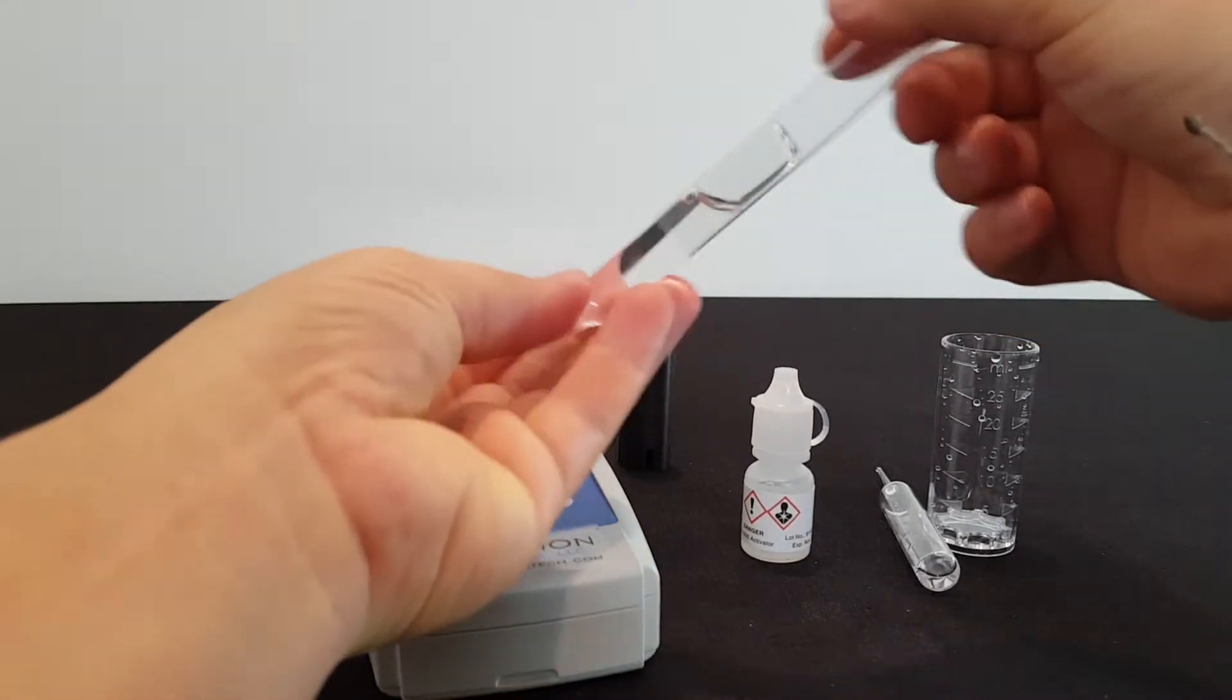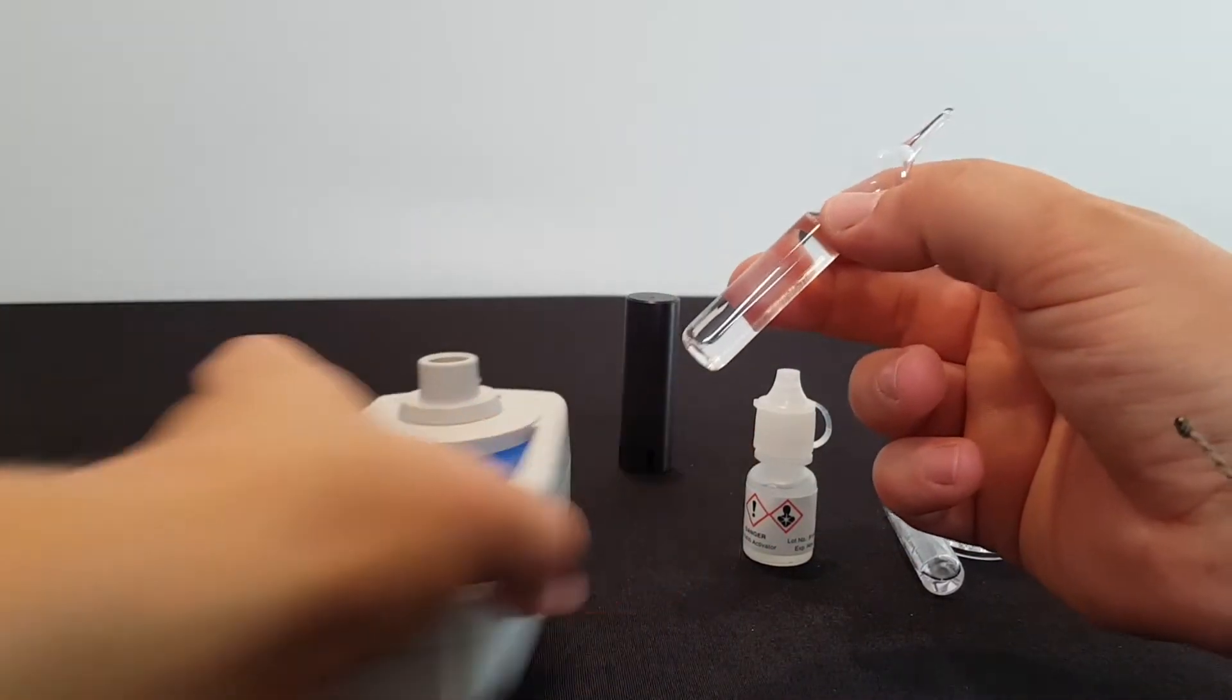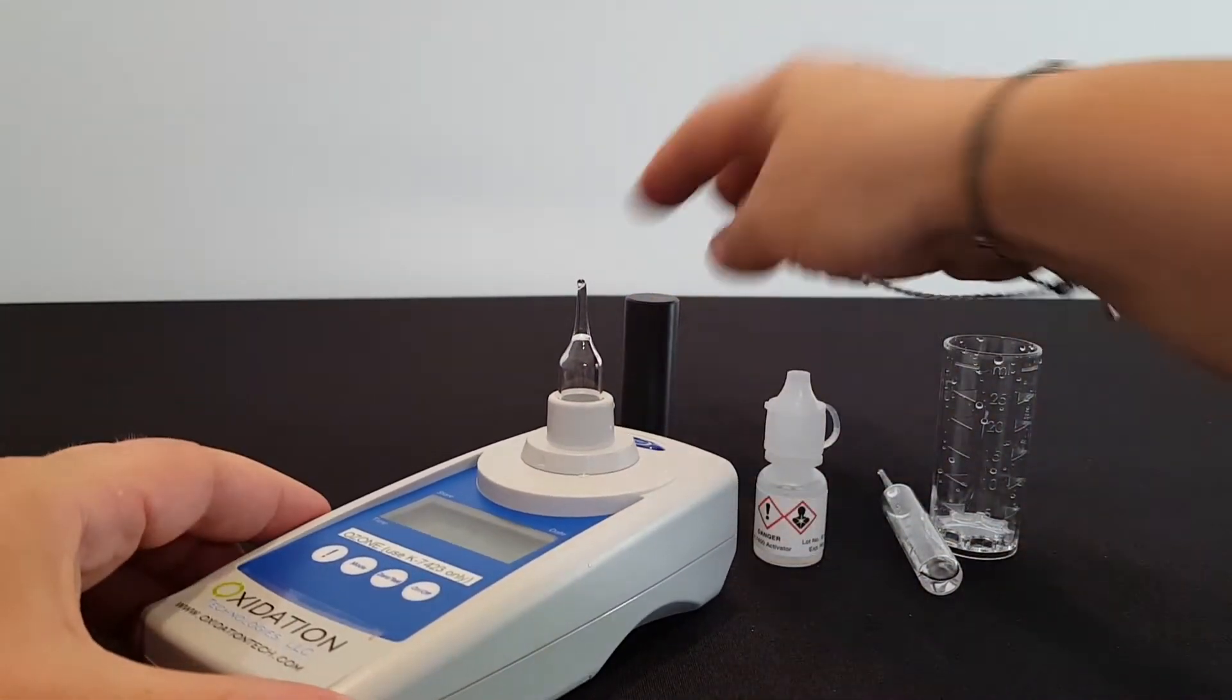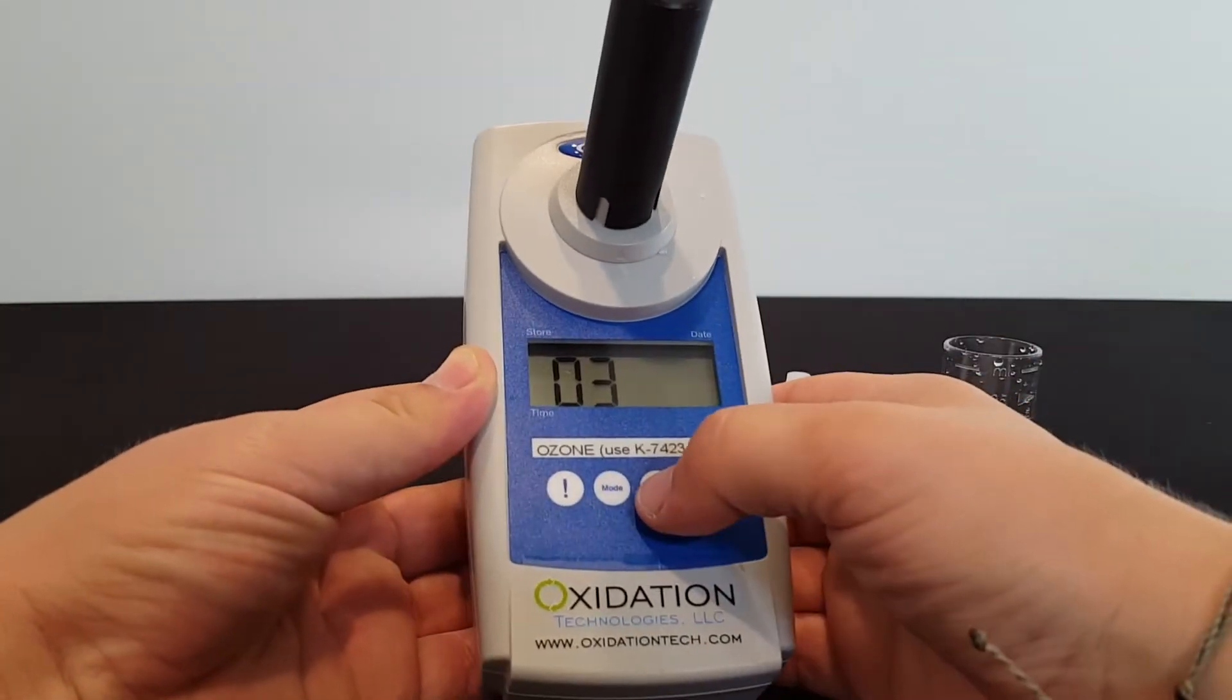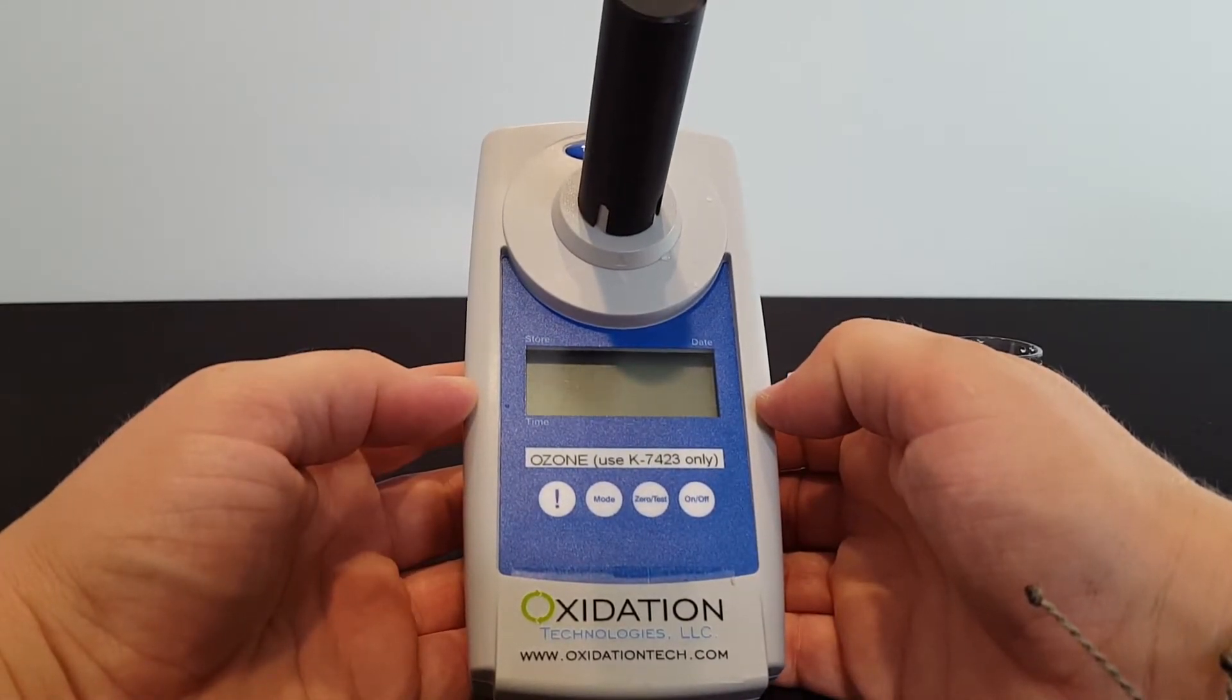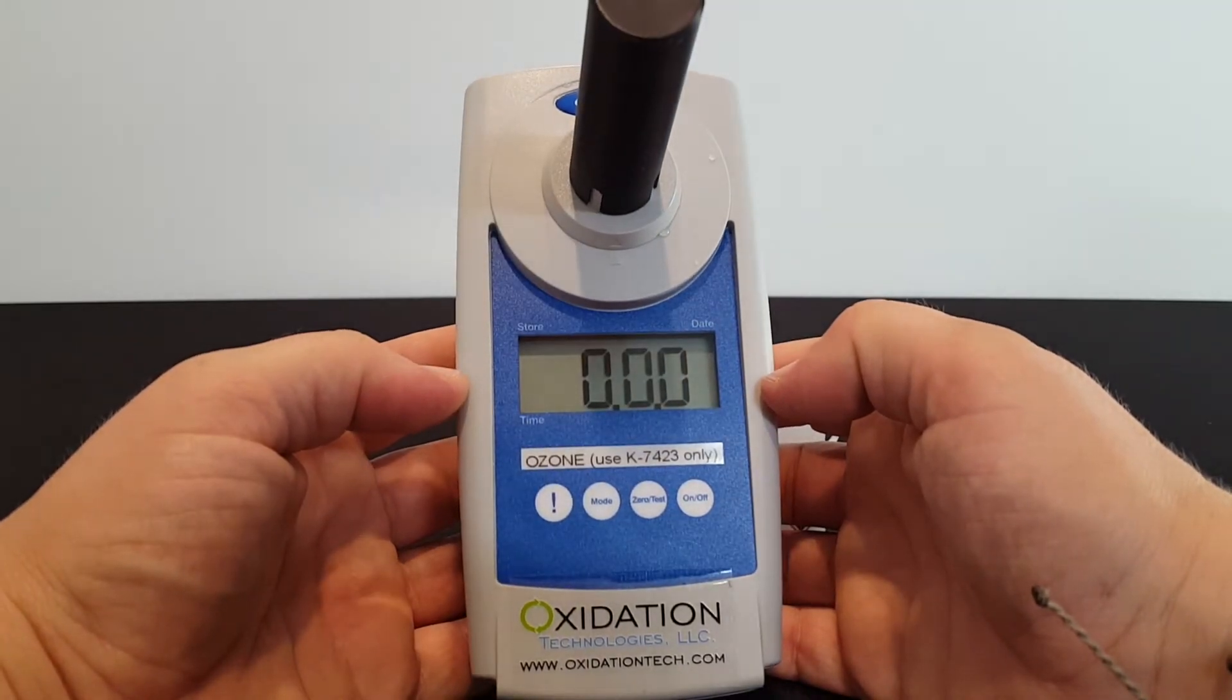I'm going to take the zeroing ampoule. This is included with each kit. I am going to press it all the way down into the port. I'm going to put the light shield over it, and then I am going to press the zero test button. The O3 symbol will flash for about eight seconds, and then the screen will read 0.0.0.